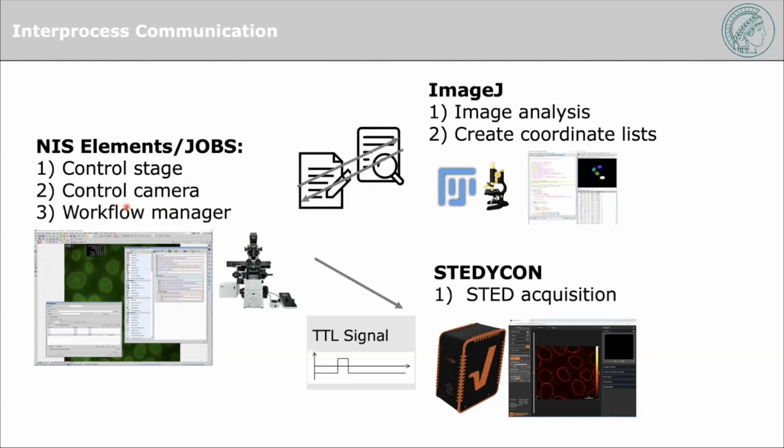To this, we wrote extra code in a macro language to also be able to talk to an external program, which in this case is ImageJ, but it could be anything. And this was very simplistic because we couldn't figure out something better, honestly: write in and out some coordinates in a file and listen to when these coordinates change.